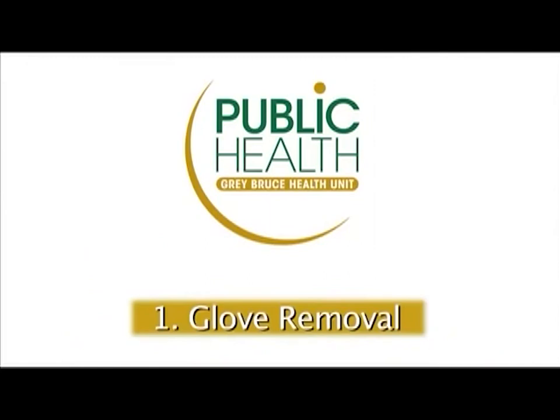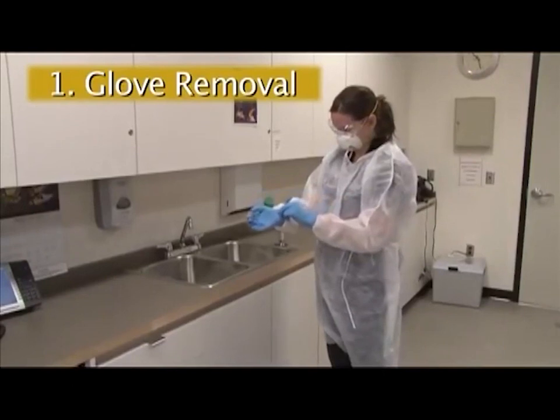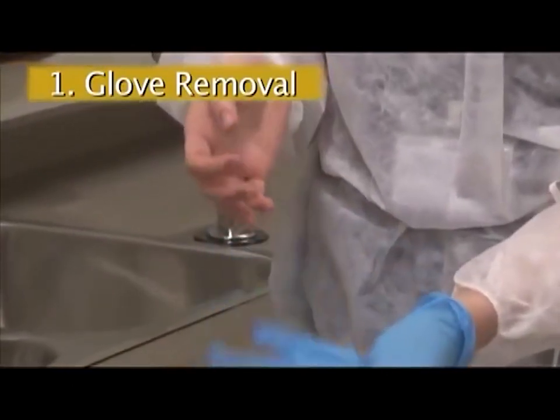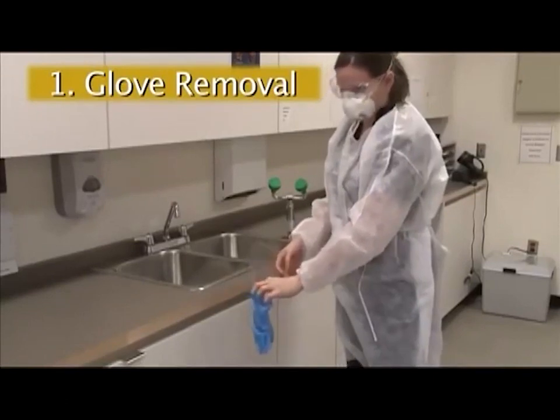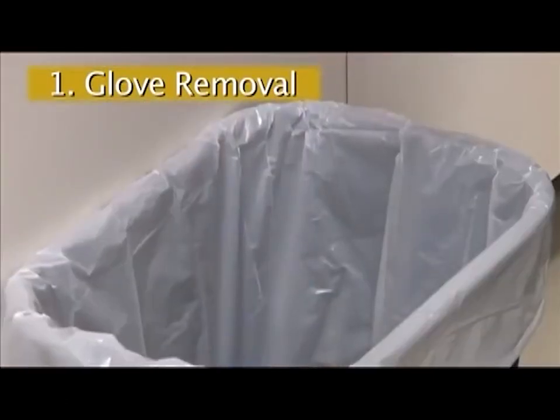The outside of the glove is dirty and must be removed with care. Grasp the outside edge of the glove at the inside of the wrist and peel away, turning the glove inside out. Hold it in the opposite gloved hand and slip a finger under the wrist of the remaining glove. Peel off from the inside, creating a bag for both gloves. Discard immediately into the waste receptacle.